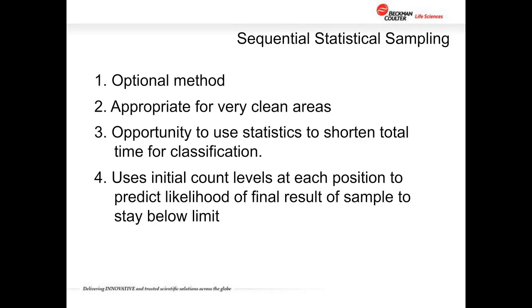However, because we're assuming certain consistency of the area over time, the sample point we're at doesn't change significantly over time, at least the time of the sampling. We're making a statistical assumption here in this method that we can quickly, by rate, figure out that we're going to pass or we're going to fail based on a few minutes of sampling.